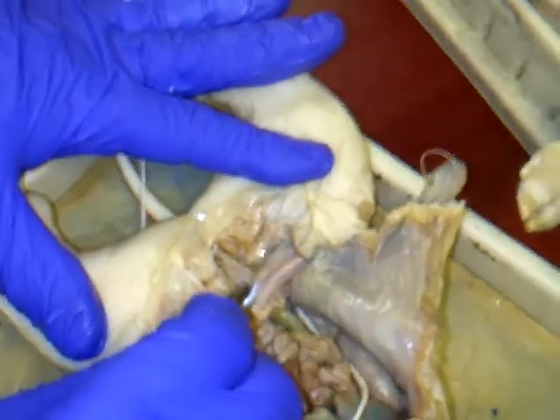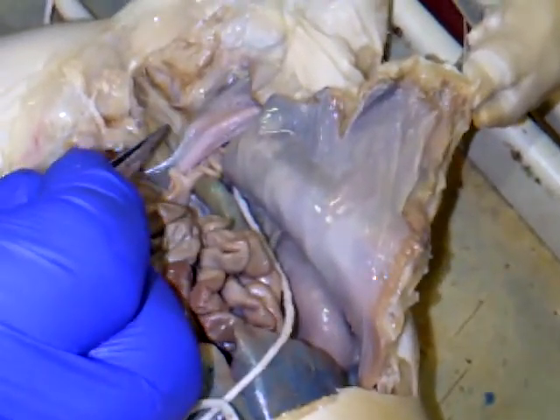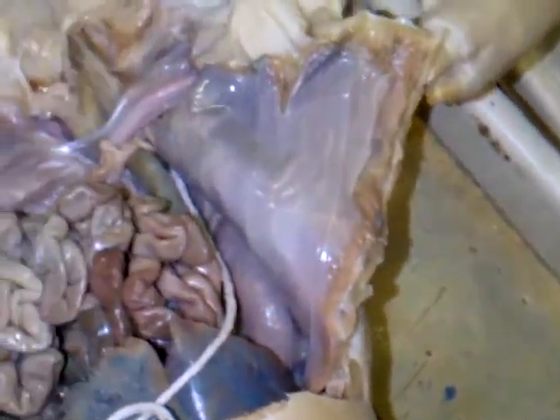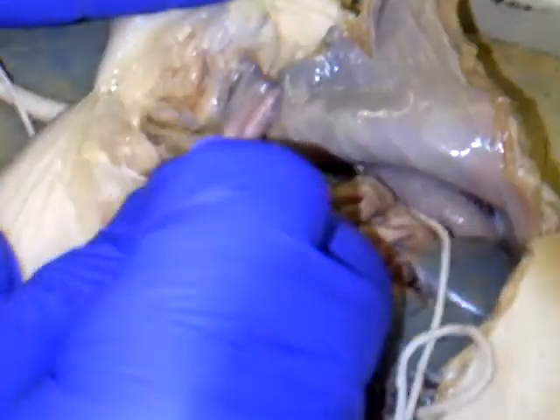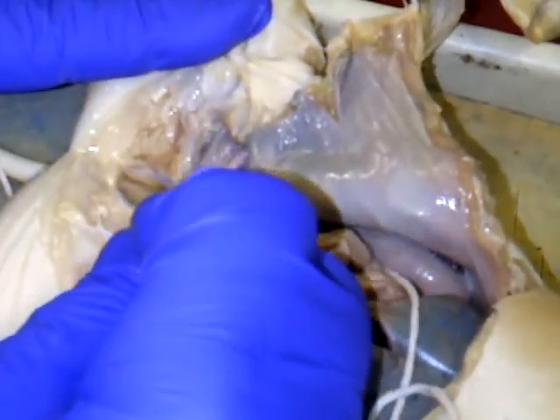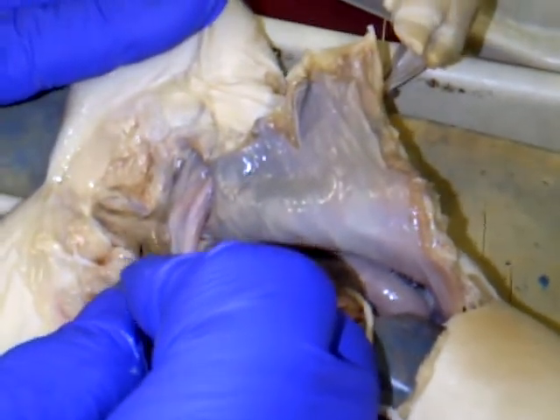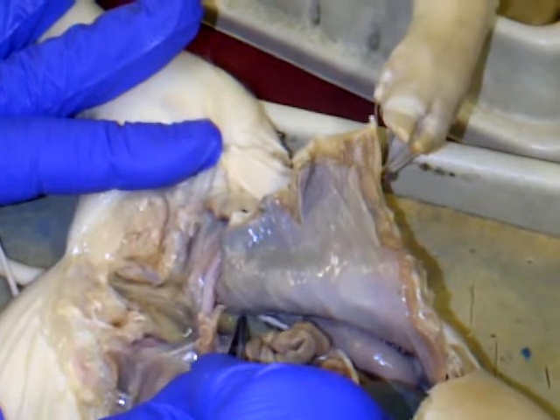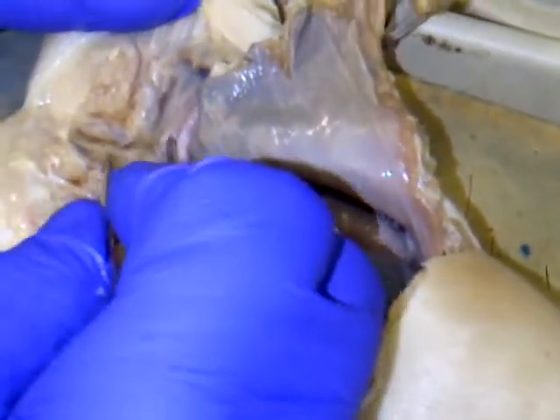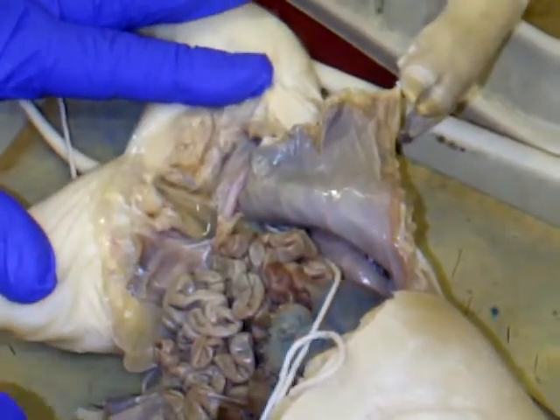And then beneath that you can see basically 1, 2, 3 pipes coming down. Urethra, vagina, and colon. In this case, the urethra and vagina end up coming out separate openings. And of course in the male, the urethra carries the semen, which carries the sperm in it. But also notice that before the pig is born, these are still fetal pigs, about a centimeter above the bottom, you see the urethra and the vagina are still joined because they separate only shortly before birth. And behind it you have the colon, which has this greenish color. As you can see, it's a continuation of the colon right up here, because there is fecal matter in the colon even before birth. The green is the breakdown product of blood cells. So there you go, urethra, vagina, colon.